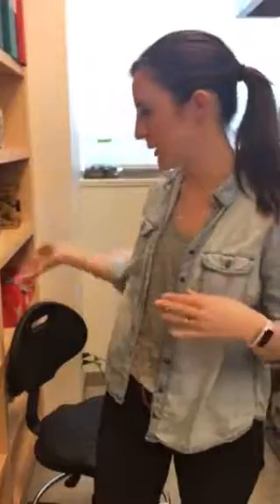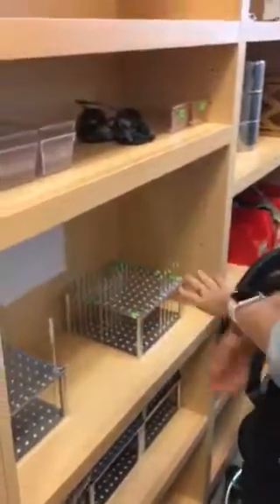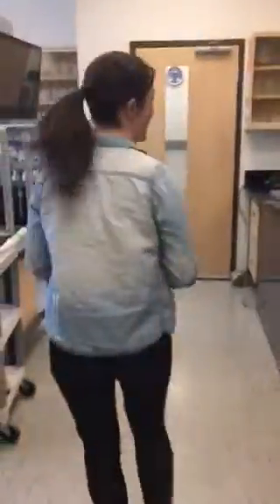So we prepare large batches of our standards. These are machine standards, not standards that go with each batch. Each batch has its own batch of standards. And then we're ready for graphitization.